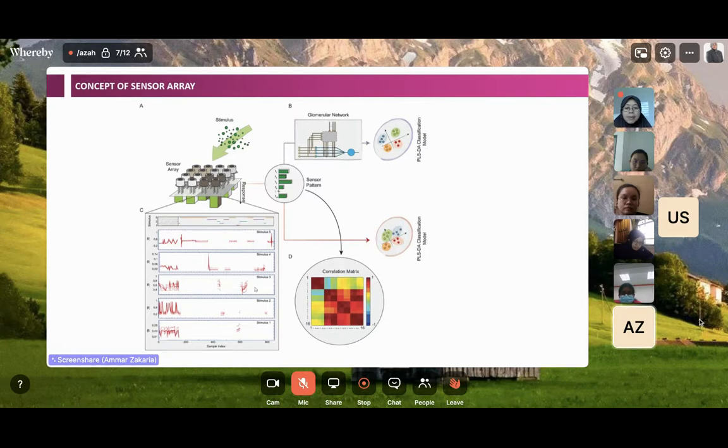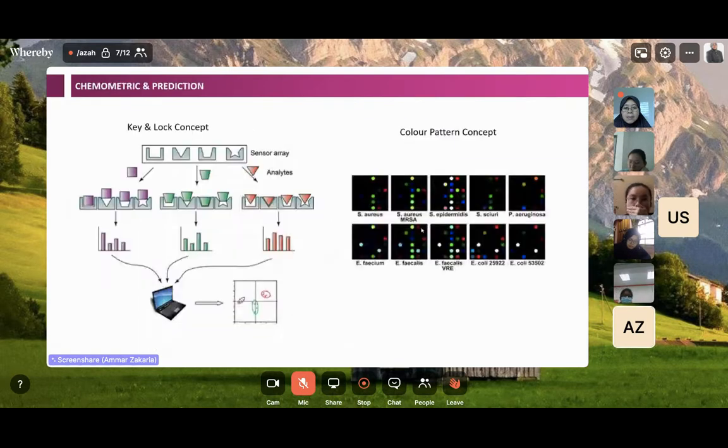It's difficult to differentiate. Of course, you can see the difference between the patterns, but to be able to tell straight away is difficult. You need to observe clearly and then see whether they are different or not, right? But if you look at this grouping, you can clearly say that there are 4 groups, right? This is how mathematics is useful to help you differentiate the groups of patterns.